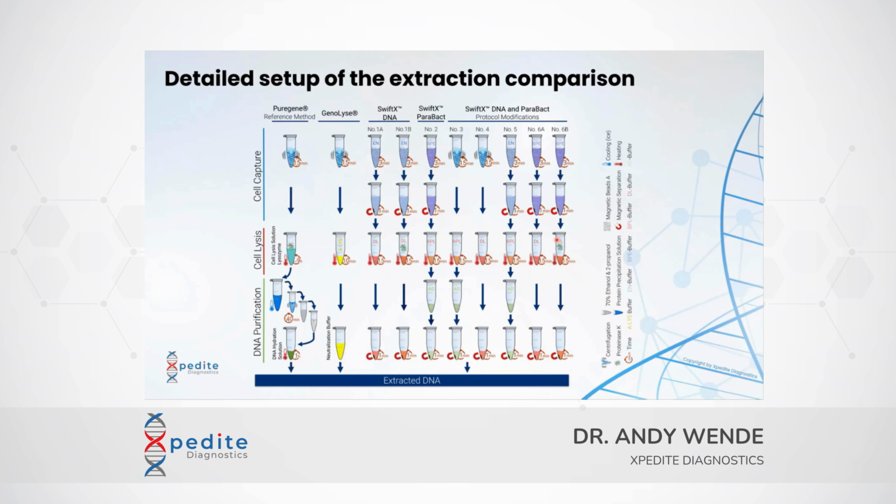So this overwhelming slide here is one graphic of the poster. I tried to break it a little bit down so you better understand what we have done here. So this, what you see here with the red frame, is the PureGene method. This is usually a centrifugation, then lysis for many hours, and then a complicated purification step, as you know it from other standard bind wash elution methods. And then also a very long hydration step to end up with the purified DNA.